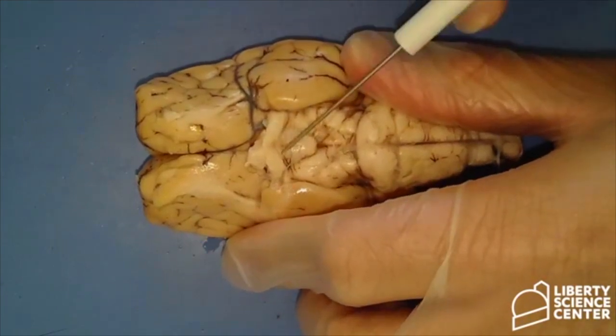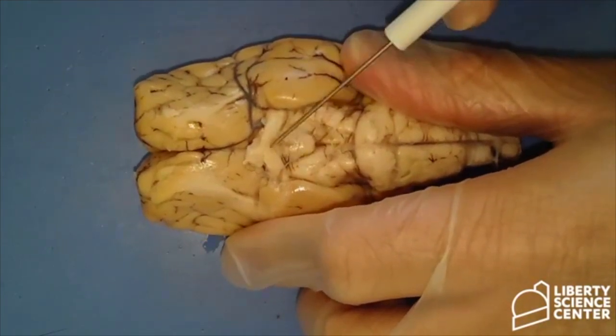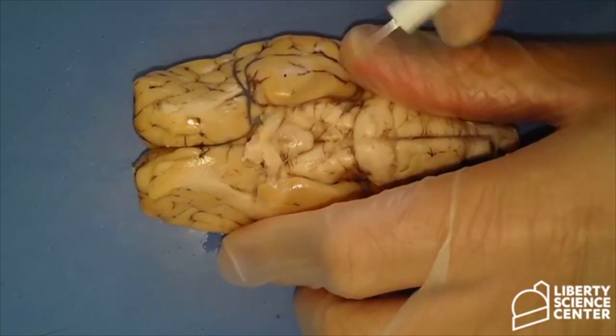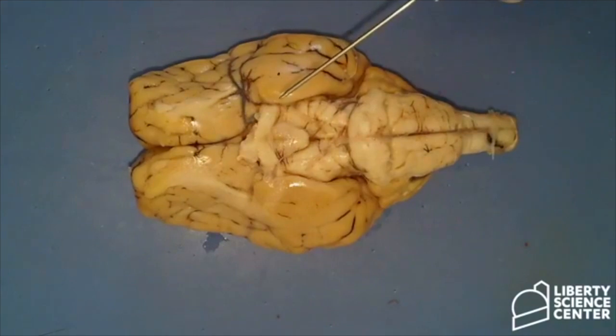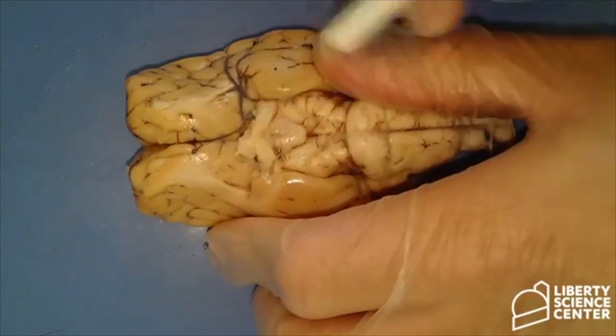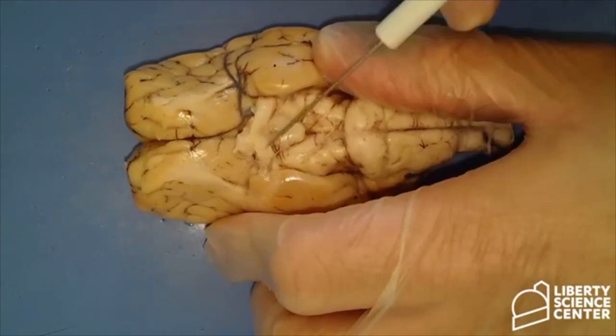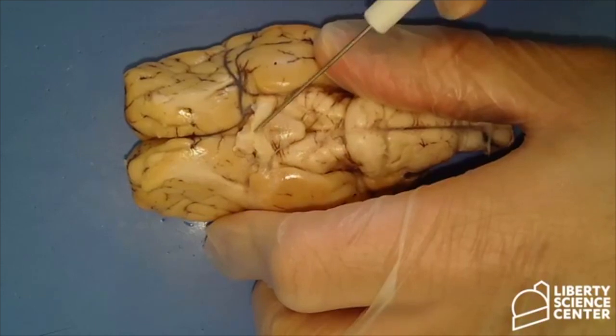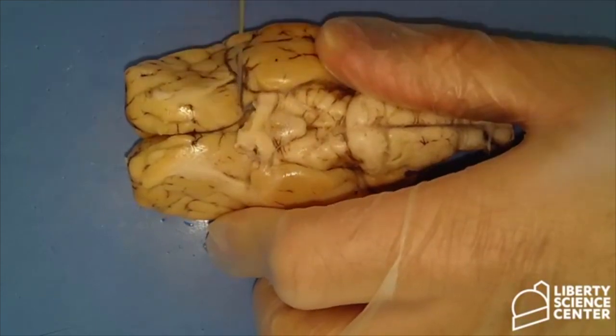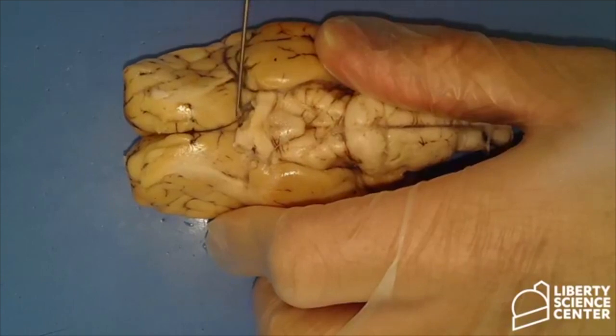We have this area right here. Unfortunately, depending on how we receive our specimens, sometimes they're not all in one piece, so I'm going to do my best to point it out for you. This is actually three separate structures in this area. This little portion right here is the optic nerve. You'll see one that should be here, and that's also the optic nerve.